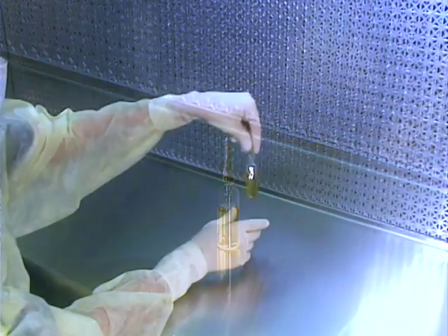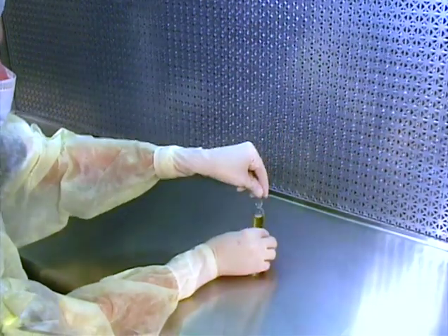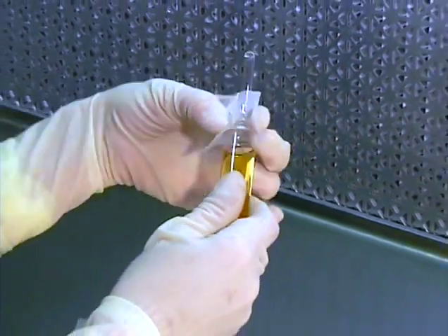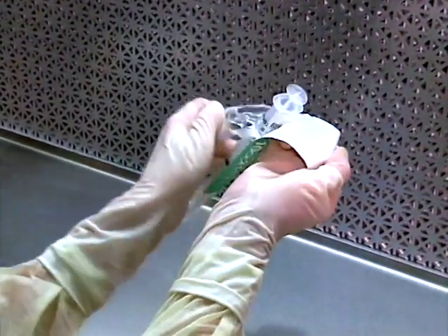Shake the ampule with a firm downward stroke to remove any drug from the top. Thoroughly clean and disinfect the neck of the ampule with an alcohol swab. This is a physical cleansing as well as a disinfecting procedure. While the alcohol is drying, prepare the syringe.